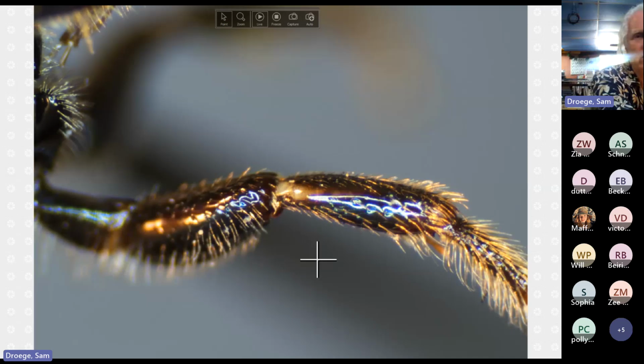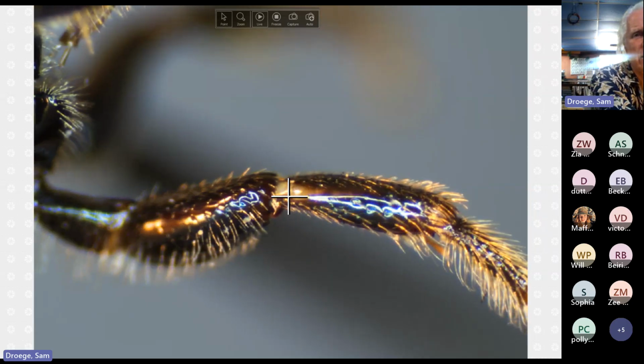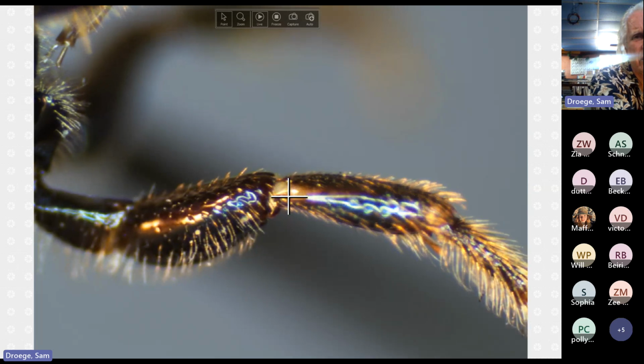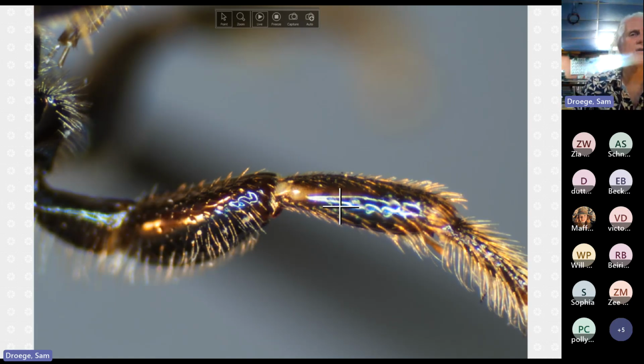Again, we're at a slightly different angle, which is good and useful. And what we're seeing is here's the femur edge, no yellow. This is reflections. And here is the tibia, slightly out of focus. At this magnification, it's a little tough to keep things so glossy in focus. And here's this white stripe. It goes even less and, you can see, it turns sort of amber at the end, but it's there.